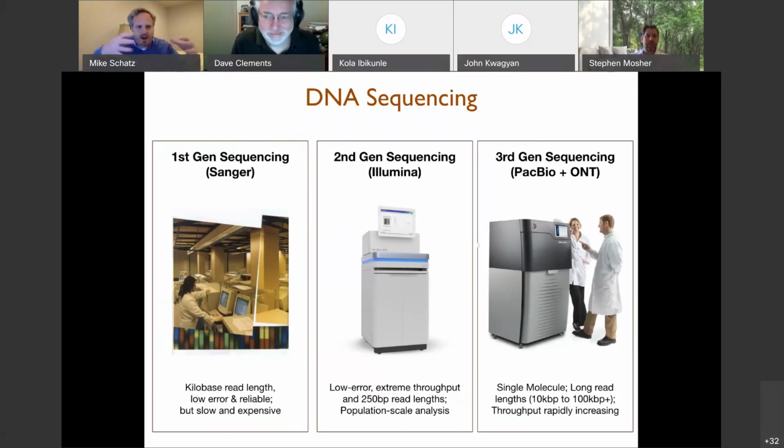And again, if we want to get across a whole human chromosome, say 150 million nucleotides long, having reads that are like 1 million bases long makes this a much more efficient operation. Now, historically, these instruments have been slow and expensive. Shown here is the PacBio RS2, which, even today on its sequel, can only sequence a few hundred genomes a year per instrument, whereas a single high-throughput Illumina sequencer can sequence thousands and thousands of genomes per year. So it is a bit slower in that regard, although it's getting faster.